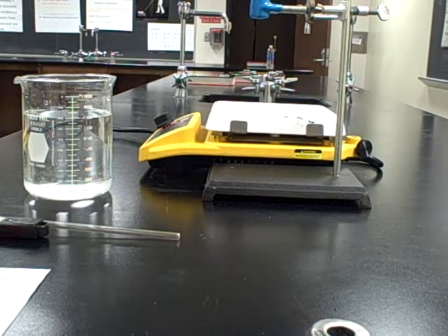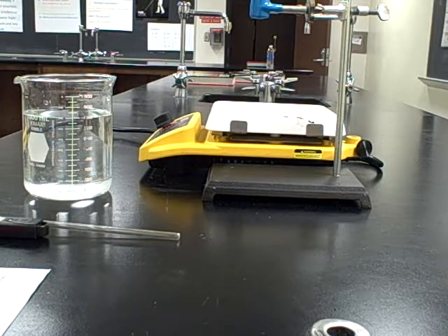Welcome. This video is going to take a look at the procedure for finding the molecular weight of a volatile liquid.